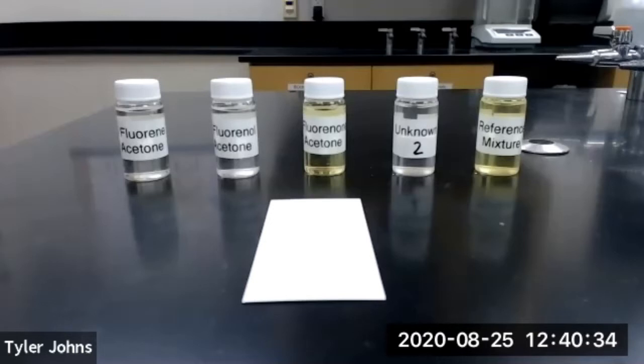And then based on the results of our known samples, we'll be able to determine which compounds are in our unknown sample.